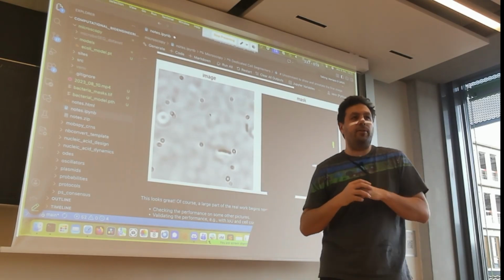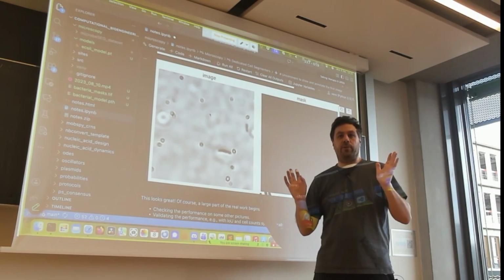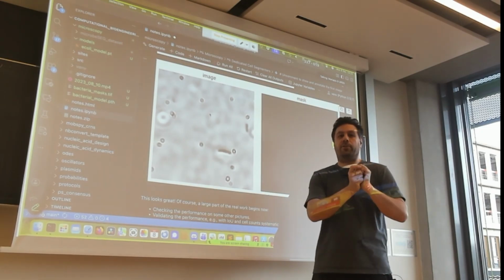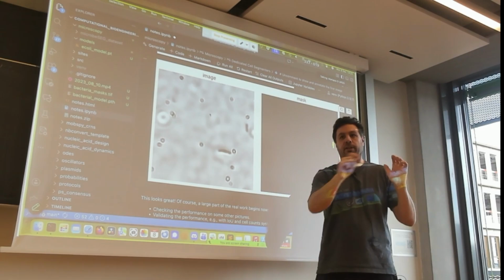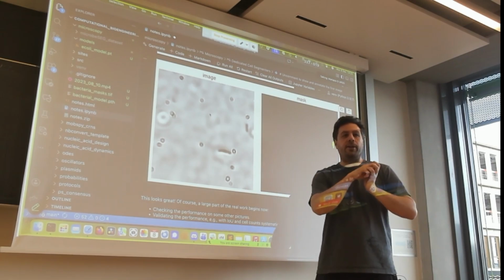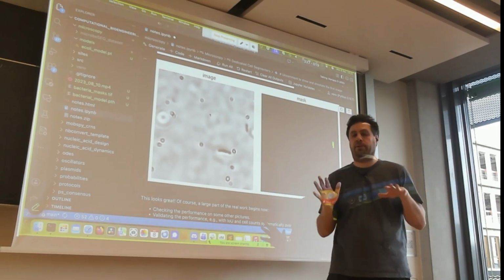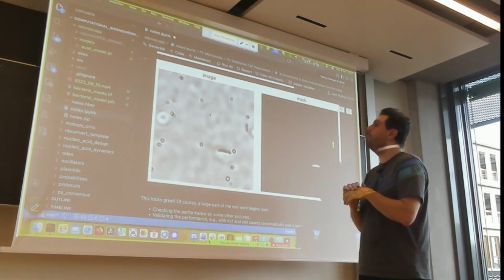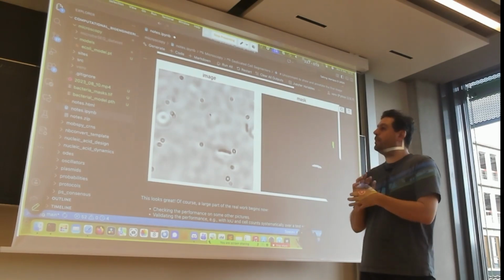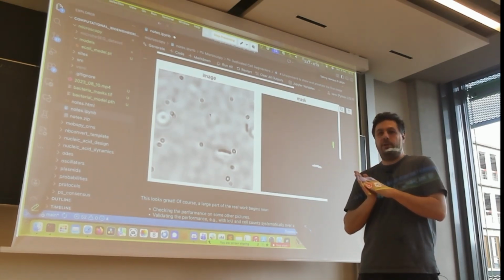In ImageJ, the nice thing is you can choose from a large variety of tools, of plugins, and you can just try out. You can just say, what would this segmenter give? What does this watersheding give? Could I add a Gaussian blur first and then do another edge detection and then only watersheding or whatever? You can very quickly prototype. So I think it's super nice for getting a feeling for different methods, for prototyping.